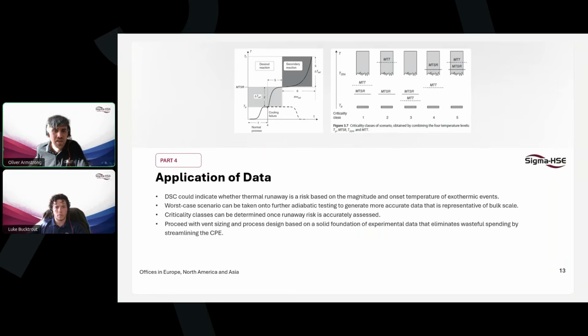So we really apply our DSC data to assess whether there exists a reasonable potential for thermal runaway reactions to occur within a system or process, or not, hopefully, and to screen different possibilities to isolate those worst case scenarios that we may advise to test with other adiabatic test methods and apparatus. These options can be assessed using typical process safety understandings, tools, and thoughts.